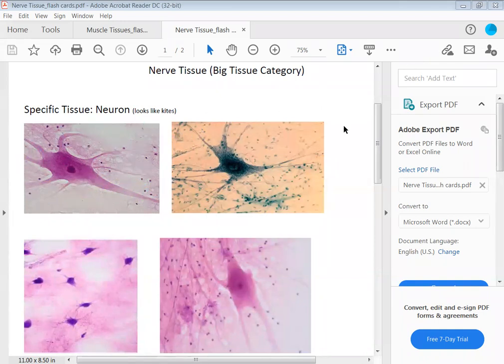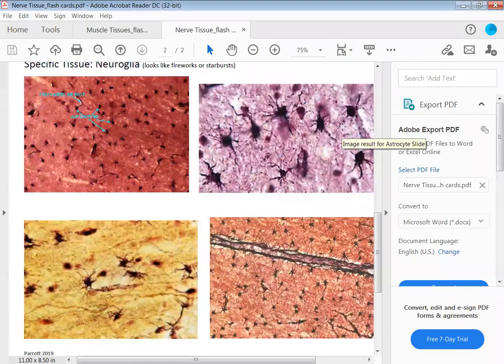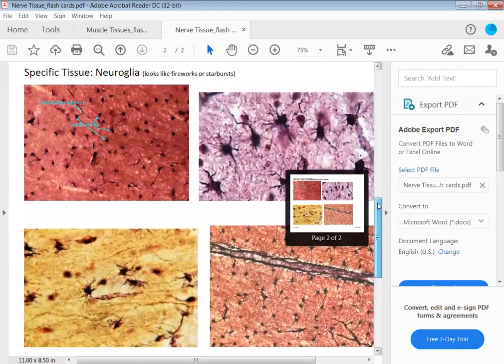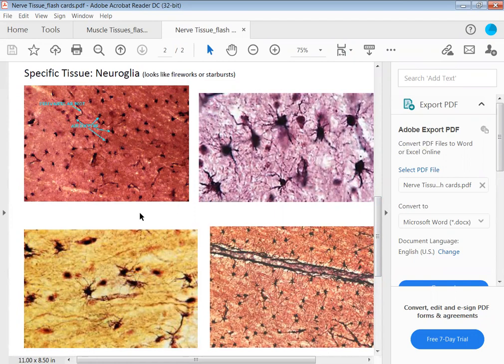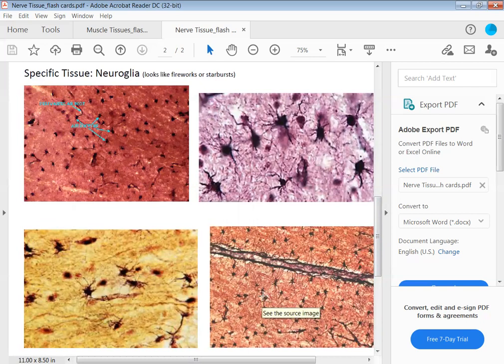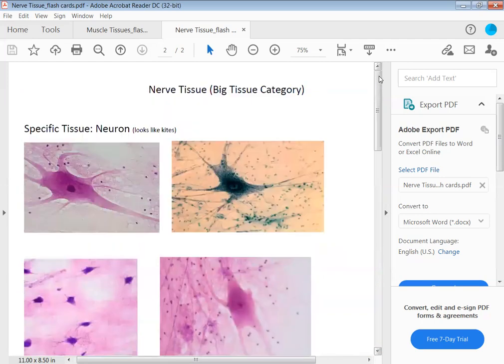The last tissue for nerve tissue is neuroglia. Neuroglia look like very dark black to dark purple fireworks or starbursts. You can see these starburst images — each one of those is a neuroglia. There is nothing you have to label in neuroglia. The big tissue category is nerve tissue, and the specific tissue is neuroglia. That covers all of your muscle and nerve tissues.